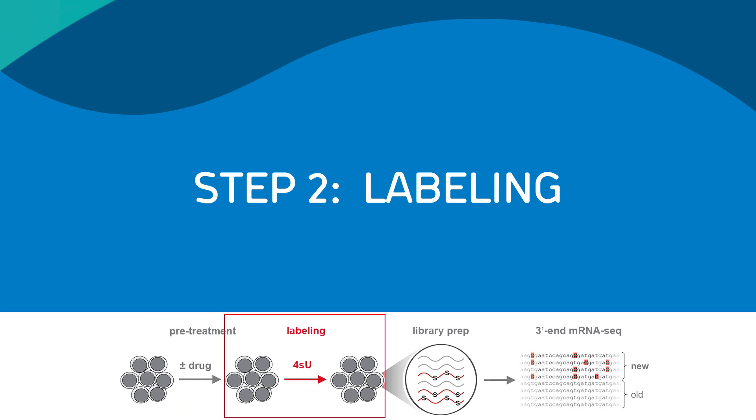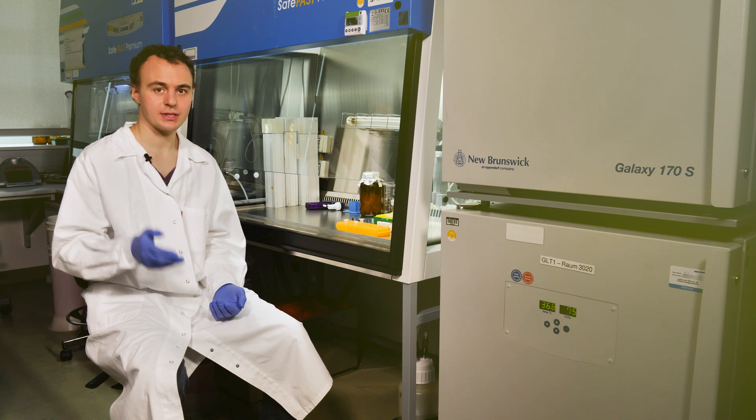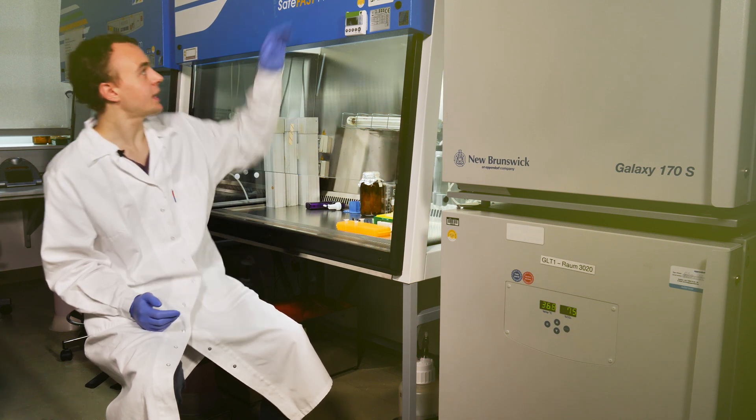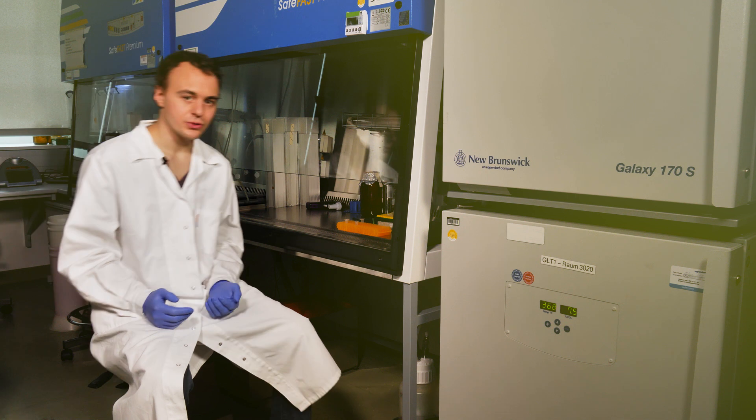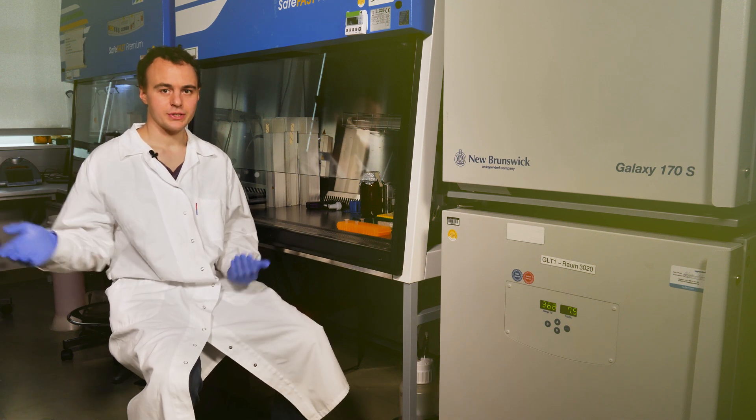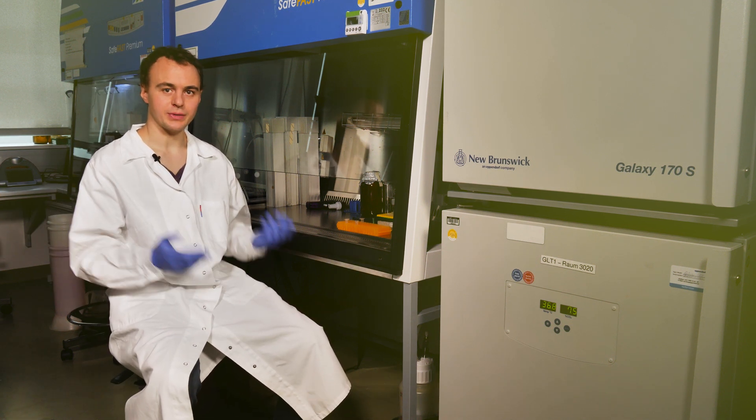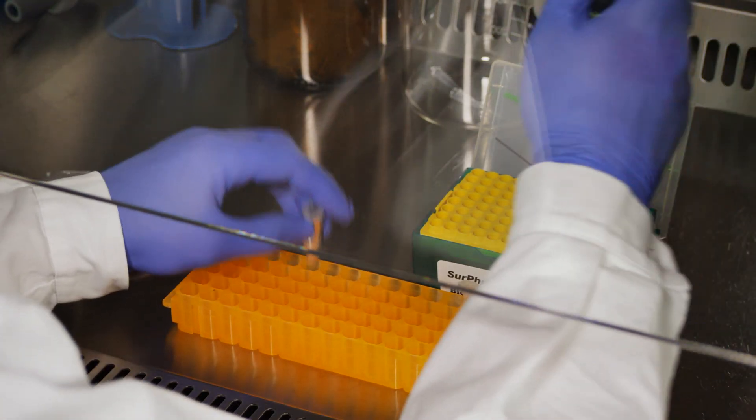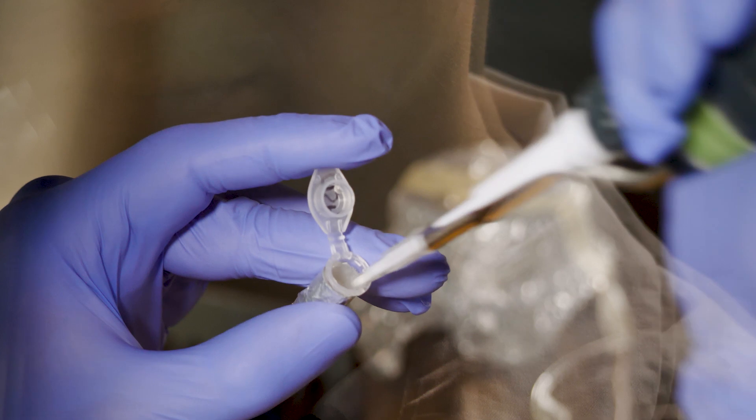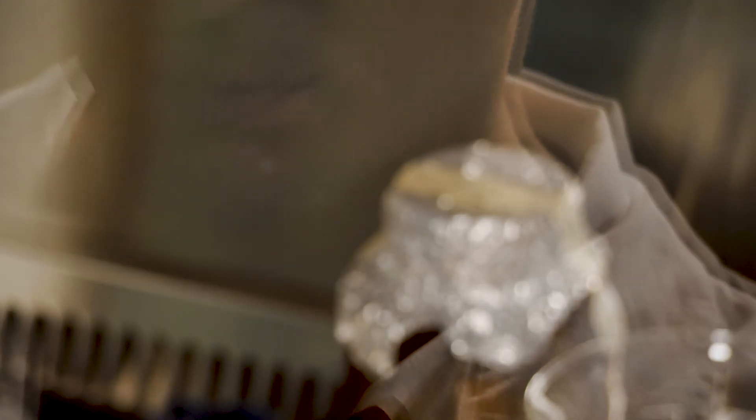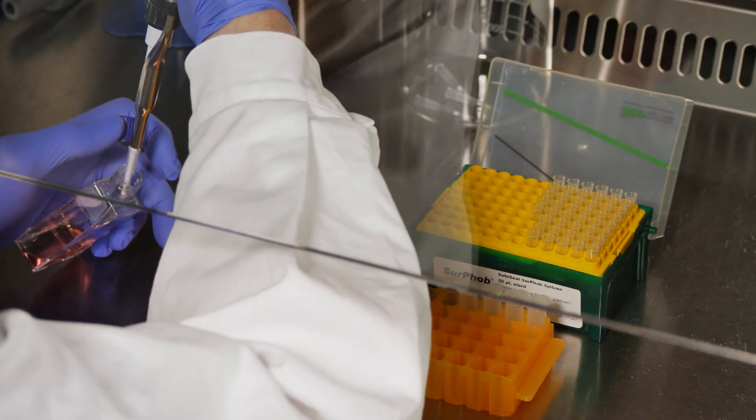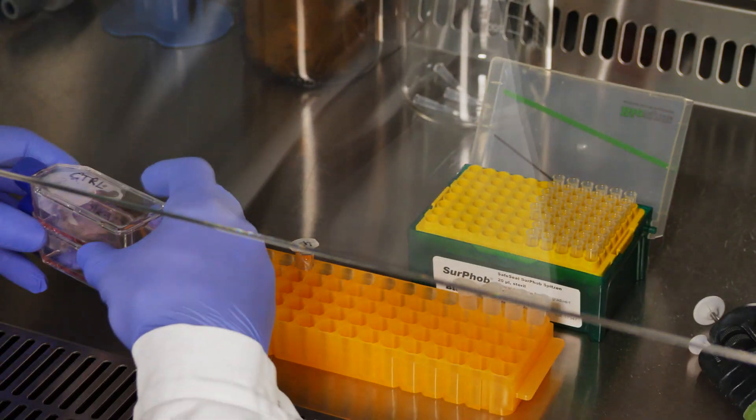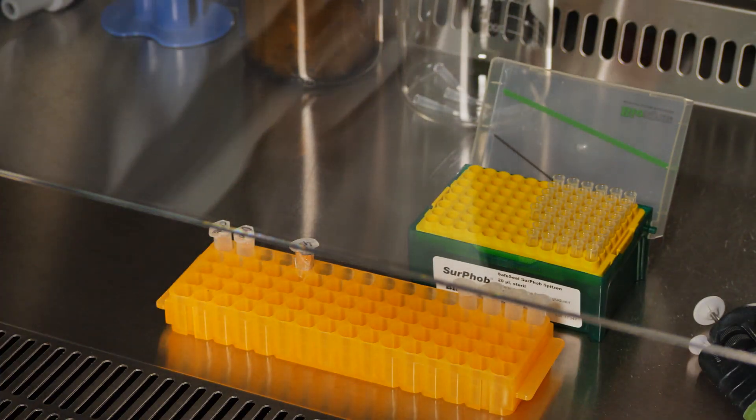Next, we add 4SU to label newly transcribed RNAs. It is important to note that 4SU is photosensitive, so we'll have to turn off the light in our cell culture hoods. And also later on in the wet lab you will see we will protect our samples from direct light exposure. Now we add 100 micromolar of 4SU to each of our cell cultures. We then incubate the cells for another hour to let them incorporate the label into newly synthesized RNAs.